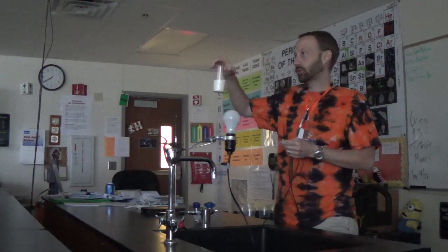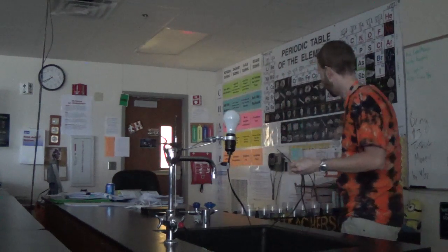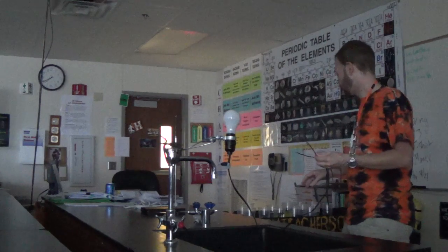Anyway, solid sodium chloride. We know salts dissolve well. We know they ionize well. Yet, I stick my wires in and nothing. Why? Because it's not wet. There's nothing for it to dissolve in. It is not dissolved. It would ionize well, but at the moment it's not dissolved, so it's not going to.